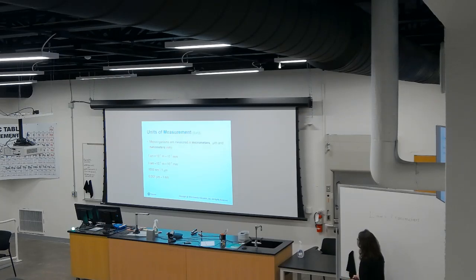Let me go back to that. So if you see there, we have 1 nanometer, which is equivalent to 10 to the minus 9 meters. So basically, this will be the same as 10 to the minus 6 millimeters.